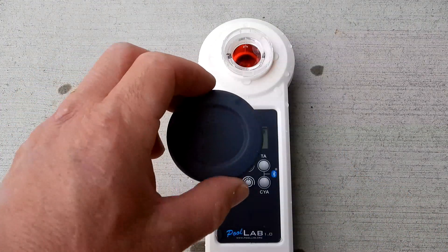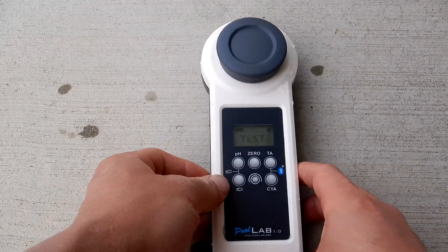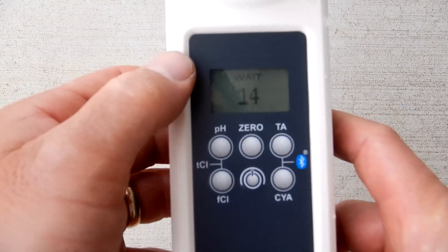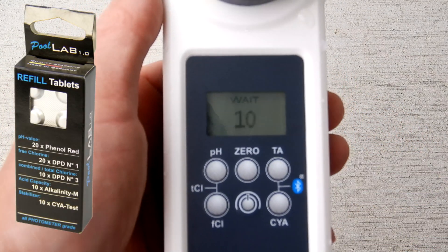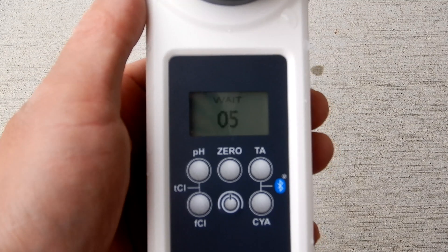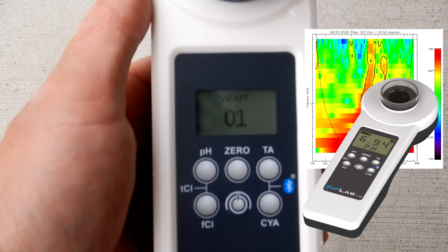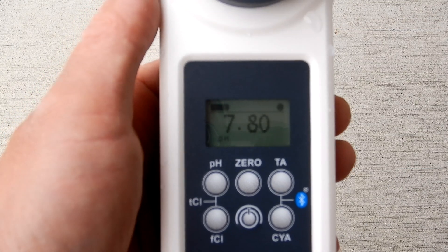Cover the water sample with the cap. Since we're doing pH, hit the pH button. It'll count down, then give you the pH reading. Since you're using tablets with pre-measured reagents, this gives you very accurate results. The built-in photometer reads the color of the reagent and gives a very accurate digital readout. The pH reading here is 7.8.